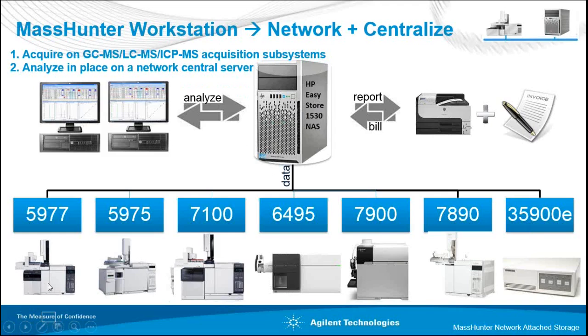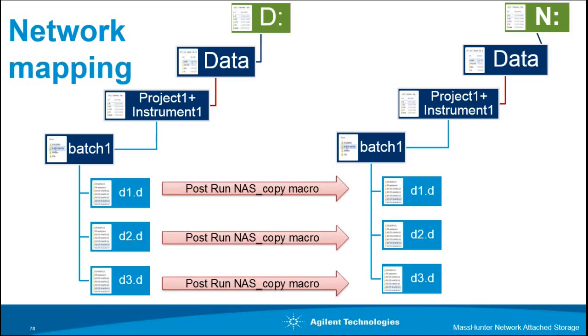So the game here is that acquisition runs and then deposits the data onto the server. This is very similar to the way the HPUX ChemStation worked, with the data being deposited on the server. So we do have in the application note the instructions for what's called a post-run action that will push the data up to the server in an organized way. So the analysts really operate on the data on the server, so your master copy of the data remains there.